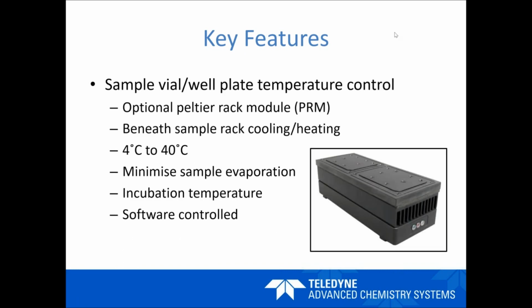Right, sorry about that. So moving on, temperature control. Certainly for lower volumes, or for samples where you've got a volatile sample matrix, or where some of the analytes might be volatile themselves, such as boron or mercury, for example, you might need temperature control to control the temperature of your samples prior to introduction. So this is an option on the system.